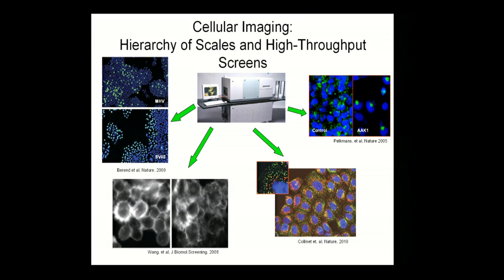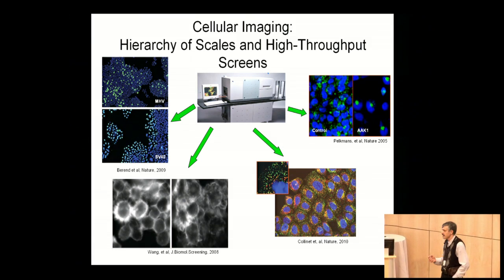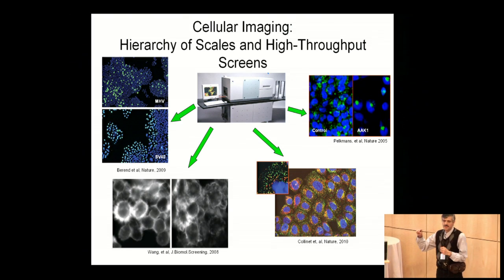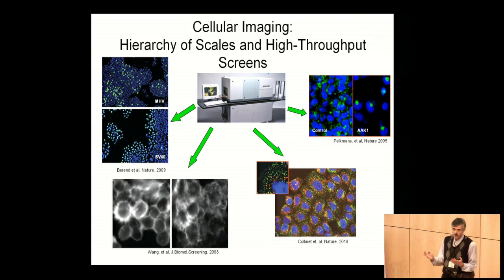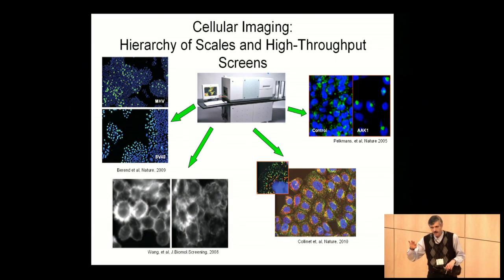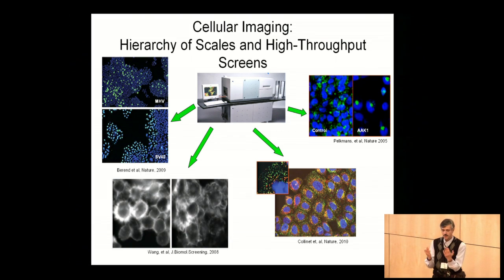There is another case, where this descriptive, presentative, illustrative way does not work. This is when you go to some phenotype or some data which is not black and white. On the previous one, I just showed, look, this green dot on this red line, this endosome on this part of the cytoskeleton. You see it. In another example, which is normally a control, you don't see it. Okay, this is black and white, very simple. But the situation could be much more complicated. This is a little more, and this is a little less. And if you start to compare by eye, this is very essential when you look at it together.